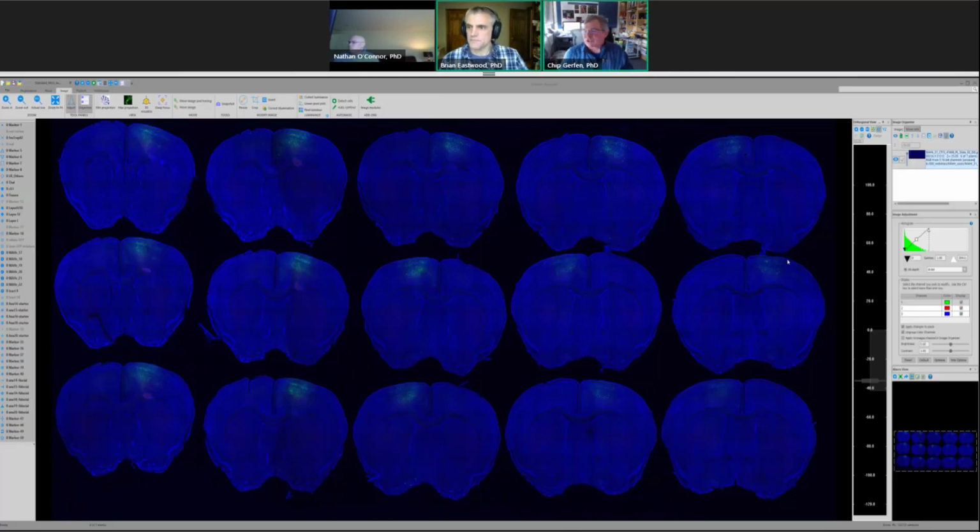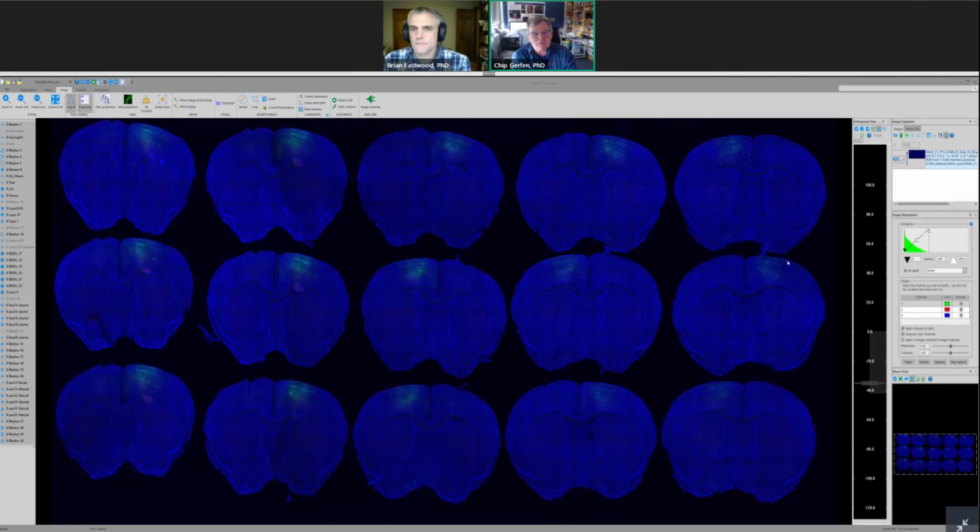My name's Chip Gerfen. I'm at NIH. I'm a neuroscientist. I've been working with the NeuroLucida and NeuroInfo program. This is the NeuroInfo MBF program that we're using that Nate refers to as the workflow. It's actually a very good program. We've been using it for years, prior versions of it.